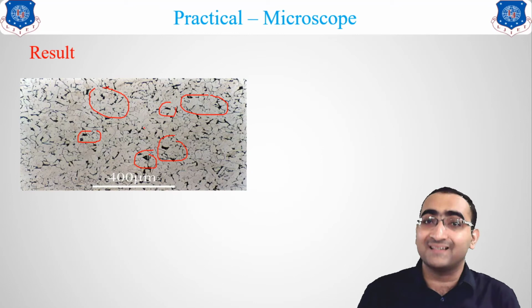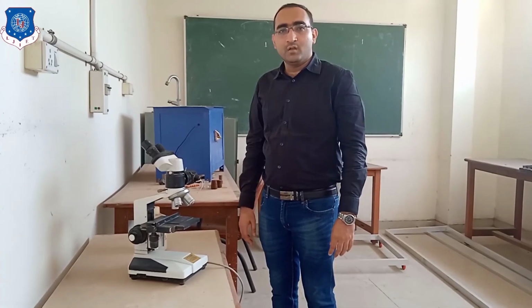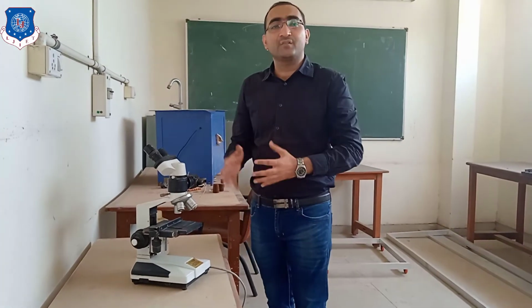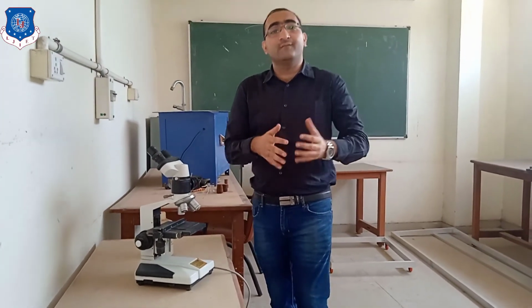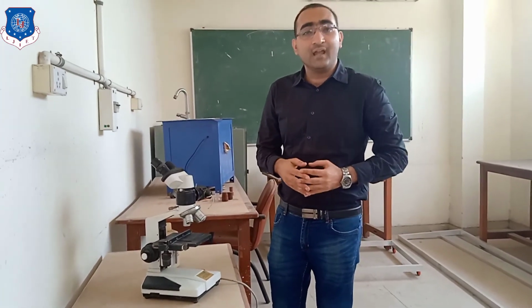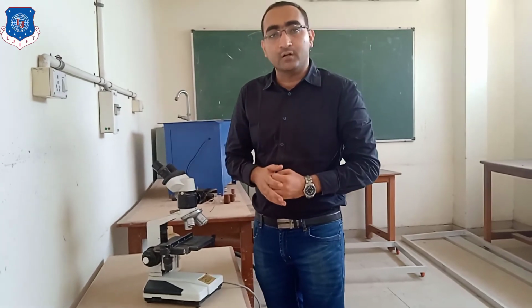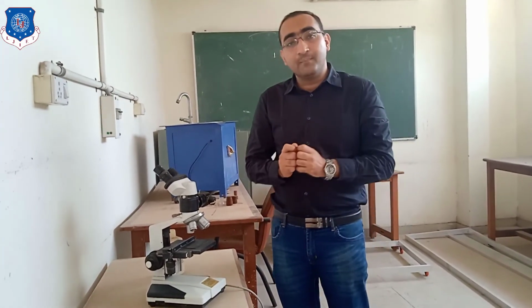Now let us see the different parts of our actual microscope. As we have seen the working of the microscope, how it works, now let us see what the different parts are and how this particular microscope works. Starting with the first one, what is the basic requirement?